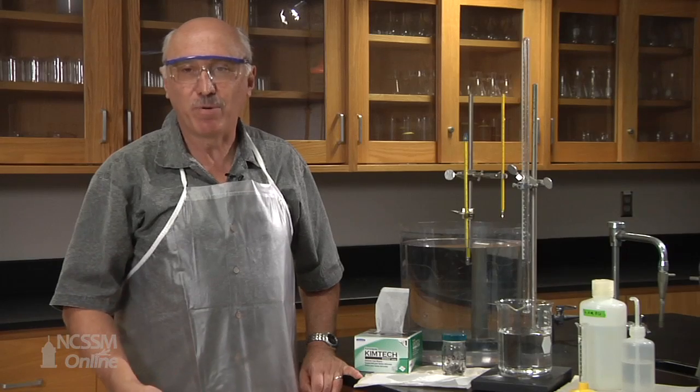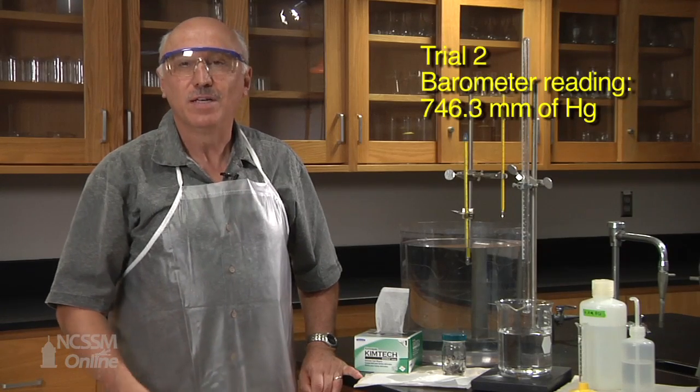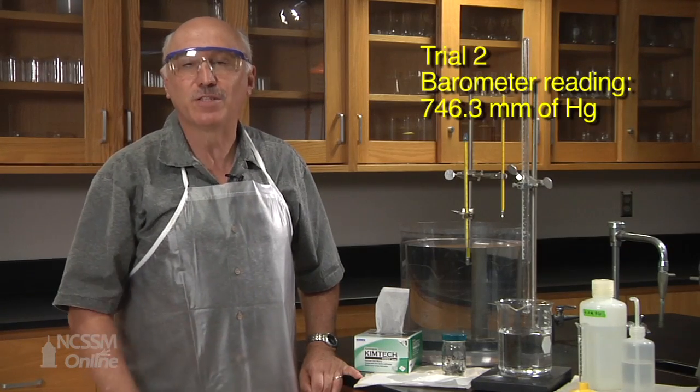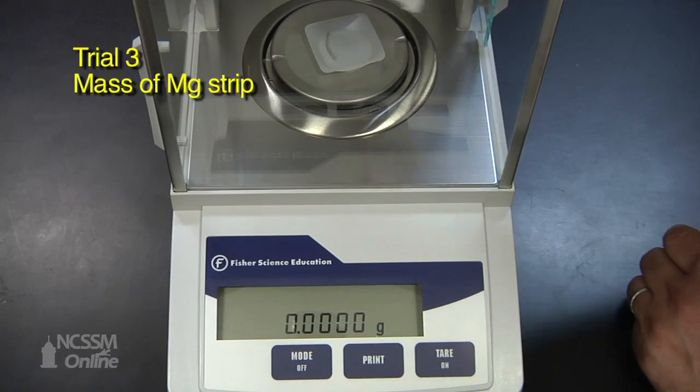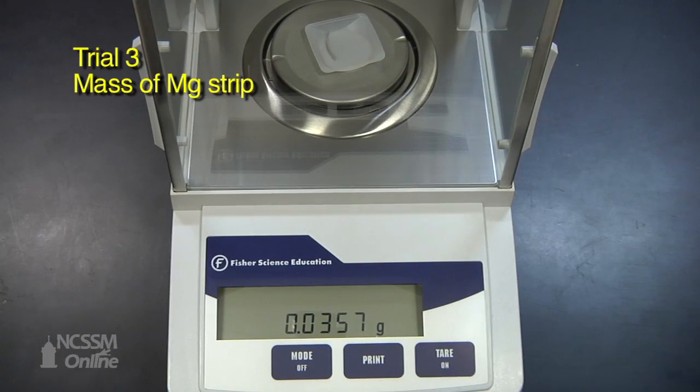The atmospheric pressure for trial two was 746.3 millimeters of mercury and now we will proceed to trial three.